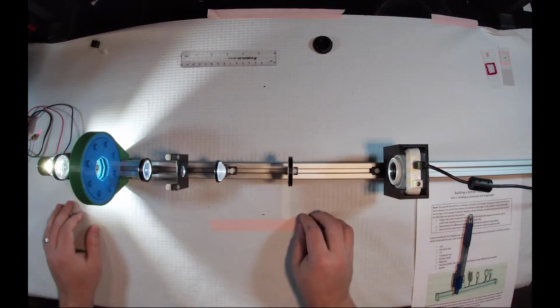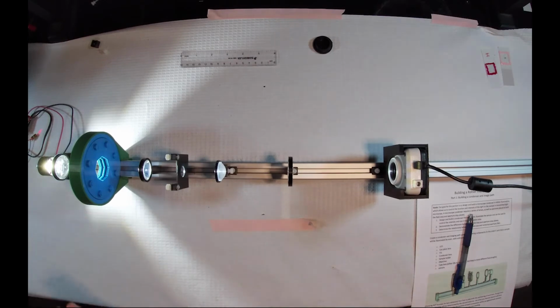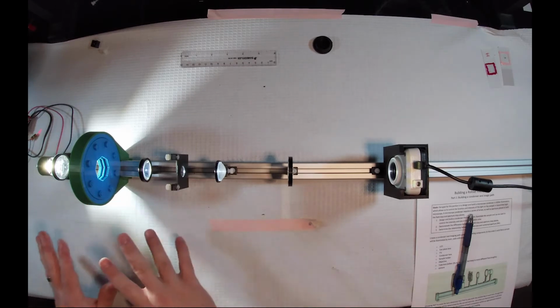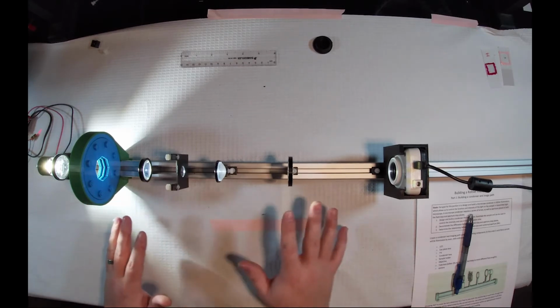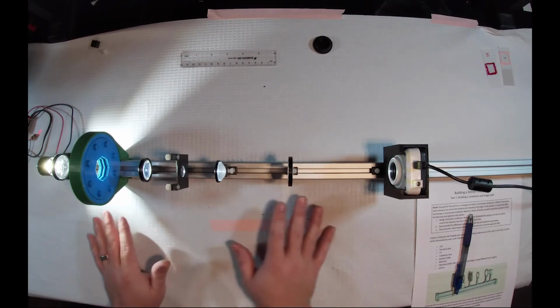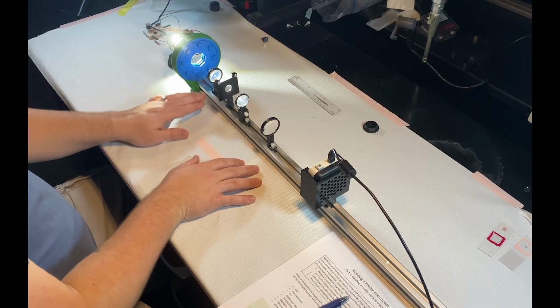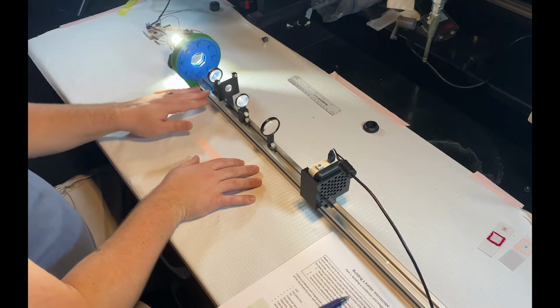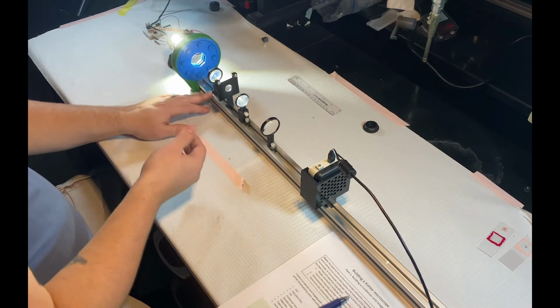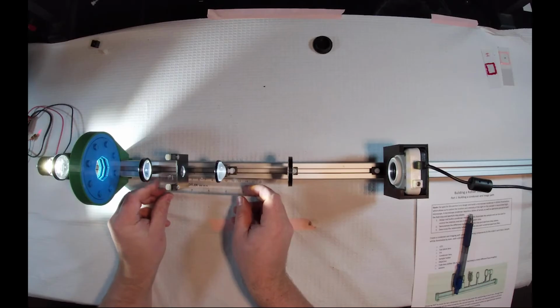Okay, so we need to start getting this aligned. Well, so we will leave the iris for later. We'll just sort of leave that alone for right now and just start to consider what do we need for these components. So we know that our condenser focal length is 35 millimeters, and our sample plane is here. So first things first, we need to make sure that our condenser lens is about 35 millimeters away from our sample.